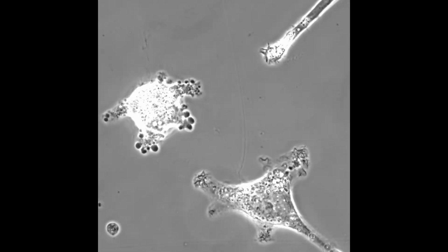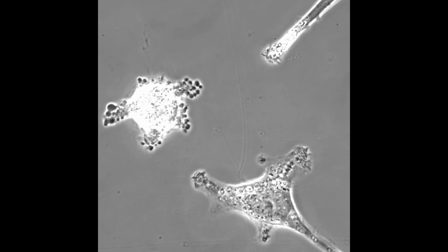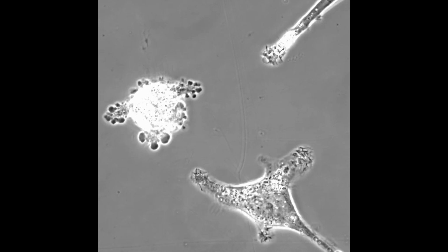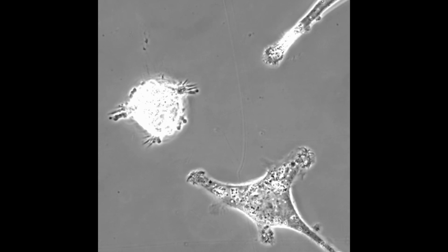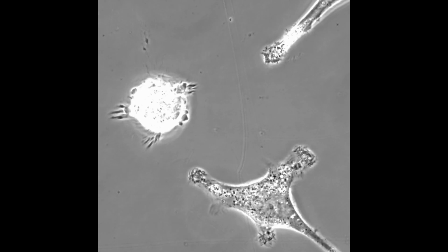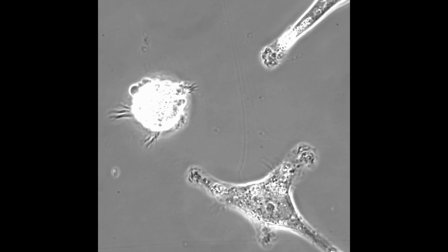Not all the cells are meant to survive forever. Apoptosis, or programmed cell death, is a natural and essential process for maintaining health. Here, you can see a cell breaking apart in a controlled manner, its components recycled to nourish and support neighboring cells.